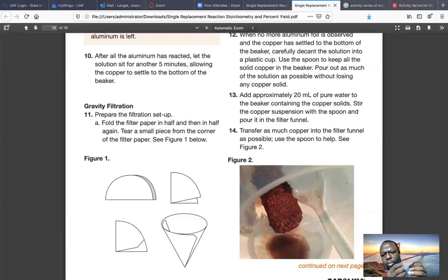Somebody will just put it in the funnel wide. You may not see there. I don't want you to put it in the funnel so that your sample will go through this space. Look at the cursor. You want to have a complete cone. When you look at it through, you cannot see anything, all right? It's a perfect cone like that.